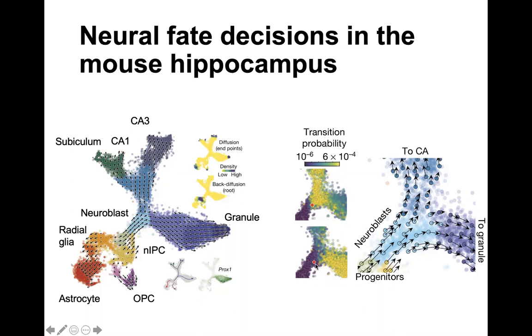And this cell, which on a global transcriptional level is very similar, is going to go down a different path. So the idea is that this is an entirely divergent fate that you would not have predicted just based off of the mRNA expression of the cell. But by looking at the ratio of spliced to unspliced RNA, you can identify this.